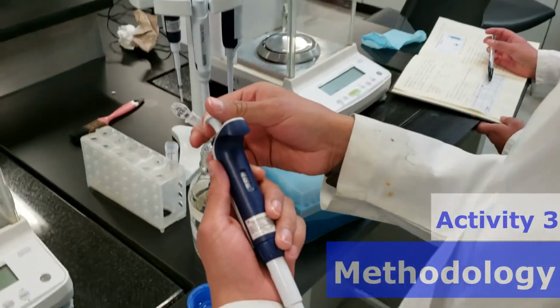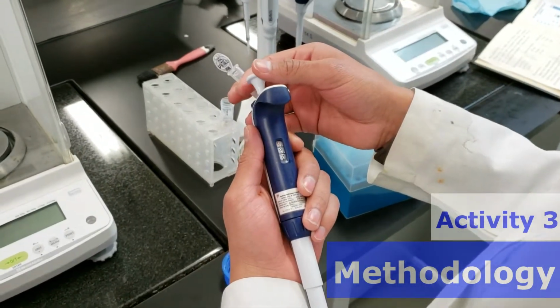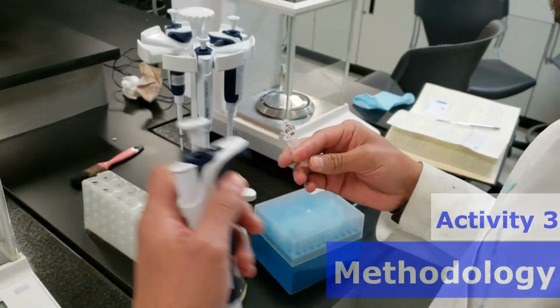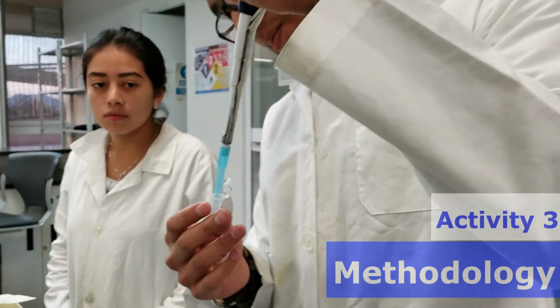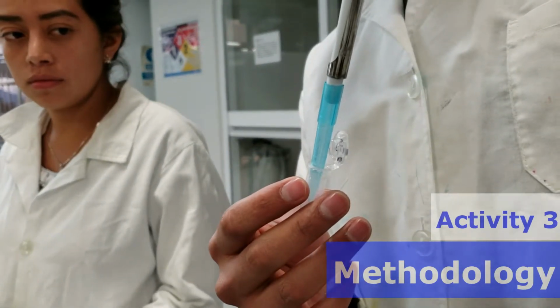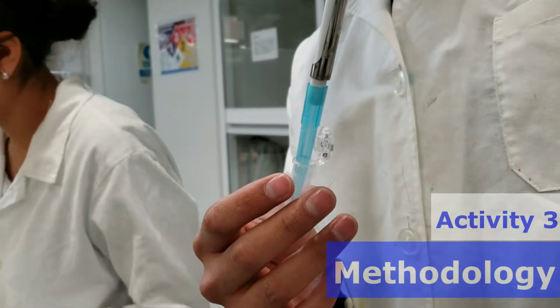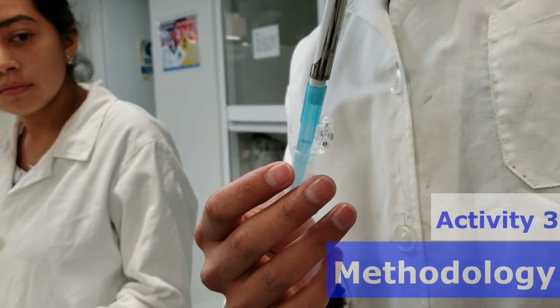Then, the volume controller was adjusted to recover all the expected liquid that was kept in the microtube. The final volume obtained was recovered assuming the volume dispensed by the micropipette was accurate in each pipette. Knowing the expected value and the real value of the measures, it was possible to analyze the results using statistical tools.